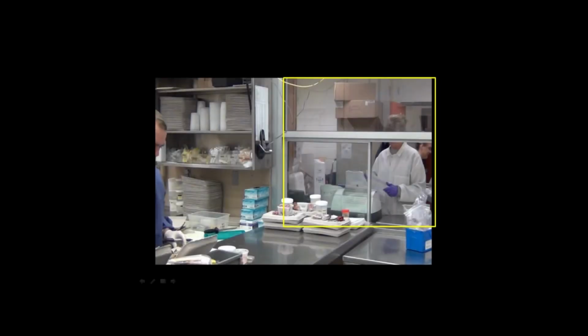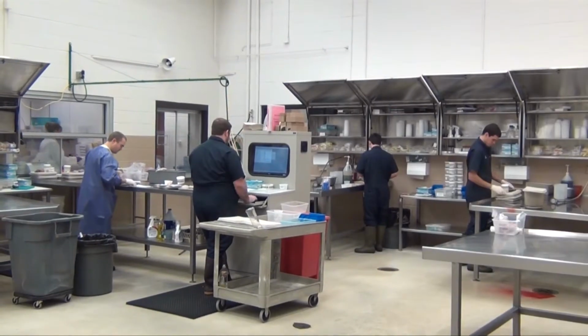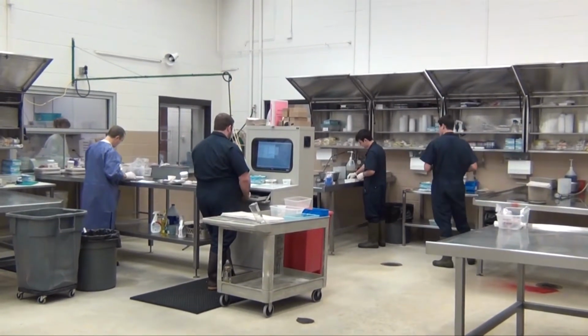After this time of triage, the staff in the pathology mailroom routes the specimens to the proper area. If the case requires a pathologist review, it is provided to the technicians and the pathologist on the necropsy floor. You can see the window that allows the pass-through of cases to the floor. If a test is clearly requested on a specimen, such as PCR on oral fluids, the case is then routed through the laboratory to its specific department.